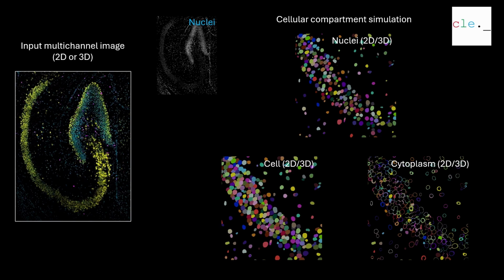This is a simple dilation operation that covers most of our use cases, defining positive cells, extracting nuclear versus cytoplasmic marker intensity. If you need a more accurate cytoplasmic area definition, I am working on doing it via Cellpose, but this is a work in progress at the moment. In addition, one can easily modify these morphological operations to simulate, for example, the extracellular space.